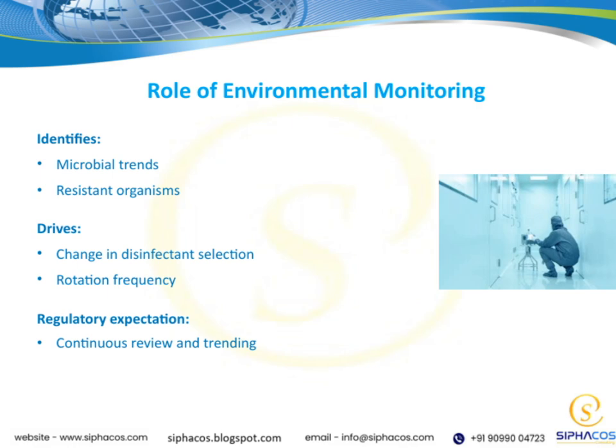And from a regulatory perspective, continuous review and trending are expectations. Regulators want to see that we're consistently monitoring, analyzing, and responding to environmental data. So, environmental monitoring isn't just a checkbox. It's a vital part of our ongoing effort to ensure a safe and effective environment.